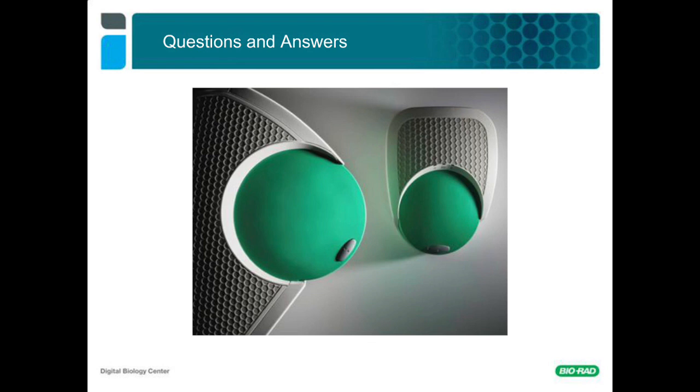So we have another question on restriction digestion. You mentioned that the restriction digestion step does not need any additional incubation time. Will the restriction enzyme be inactivated with the first 95-degree step of the thermocycling protocol? Yes, absolutely. That step will absolutely inactivate the enzyme.